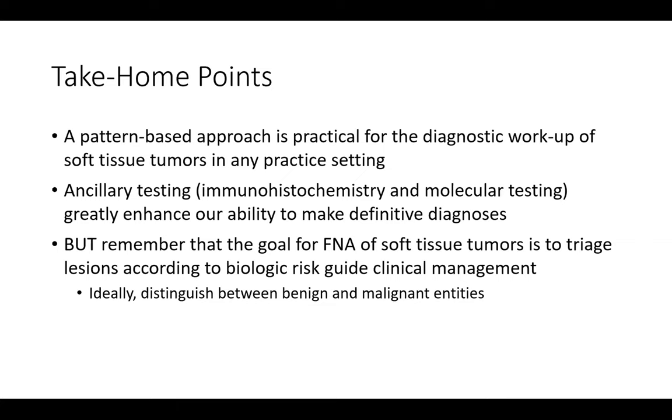But it's just important to remember that the goal of FNA for soft tissue tumors is really to triage lesions. So it's not necessary to make a definitive diagnosis. And that's really where this pattern-based approach can be helpful to at least narrow down your differential and to say with some certainty whether or not you think it's benign or malignant. And really distinguishing between those biologic risks is the most important for guiding clinical management, regardless of having all these very specific tools. So with that, I'll end and happy to take any questions.